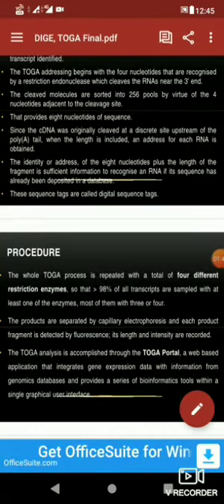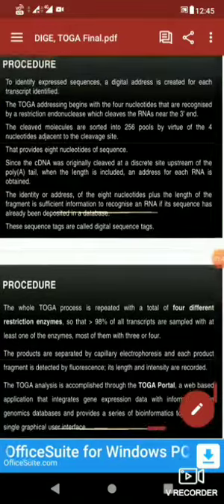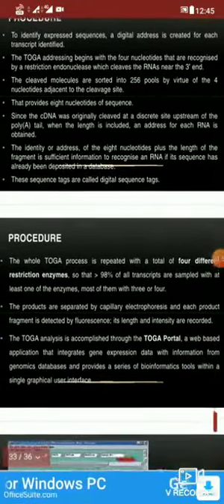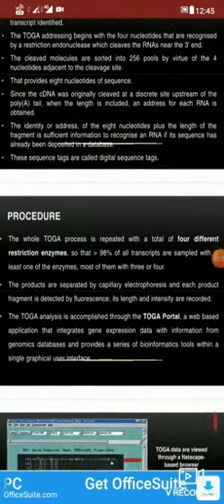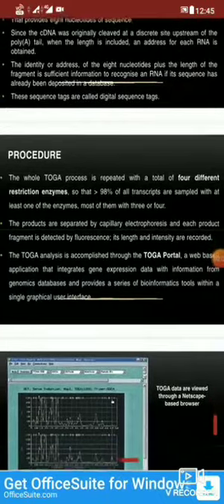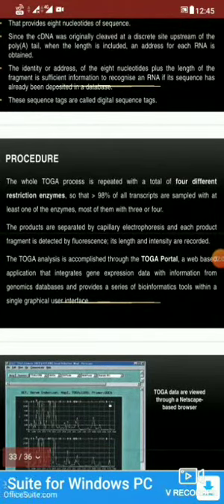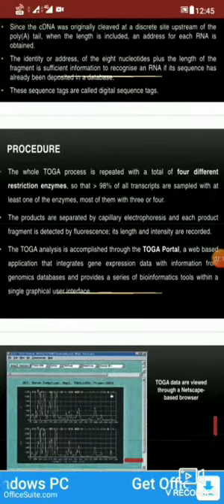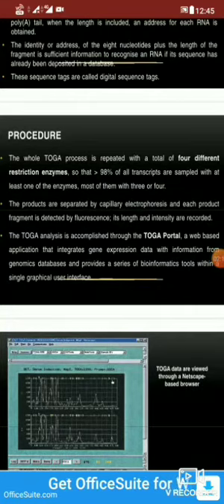It is connected with the software and you have those fluorescent primers which help us understand in each reaction how many products are produced. So at the end of every cycle you will know what type of products are produced. Based on the database available, you can identify, out of the different combinations, which one has given the maximum number of sequence data.